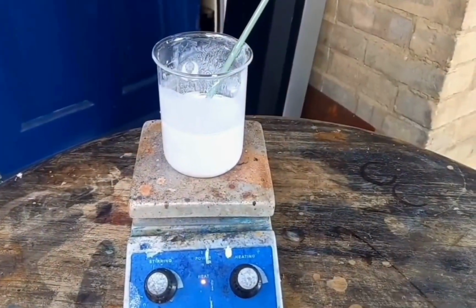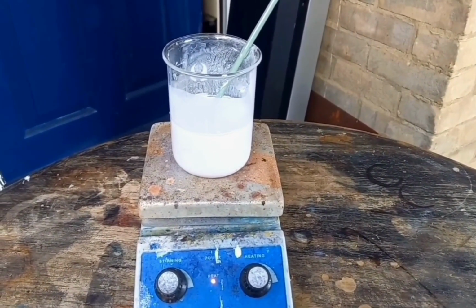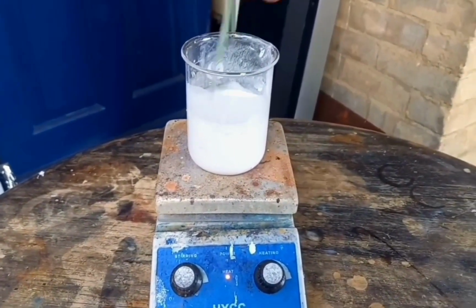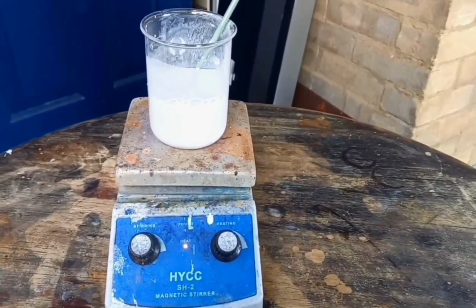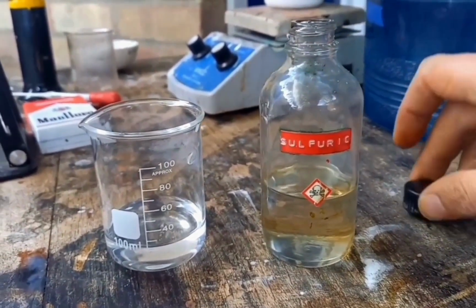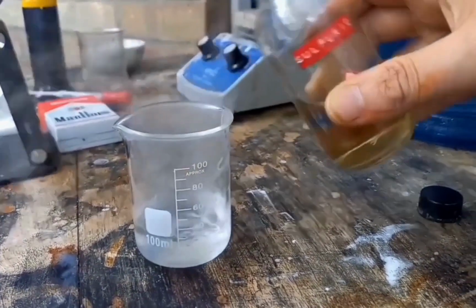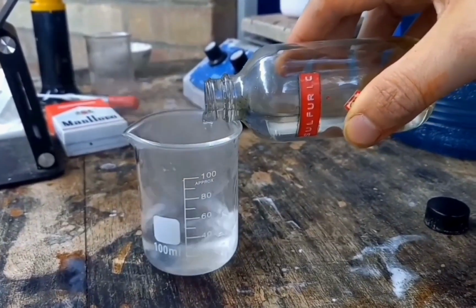Here is the barium selenate, to which I'm going to add sulfuric acid. I'm just heating it up now to hopefully, I don't know, if it's going to help this to dissolve. Here I'm going to dilute some sulfuric acid because this is a bit too concentrated. Therefore, yeah, it really heats up contact with water.